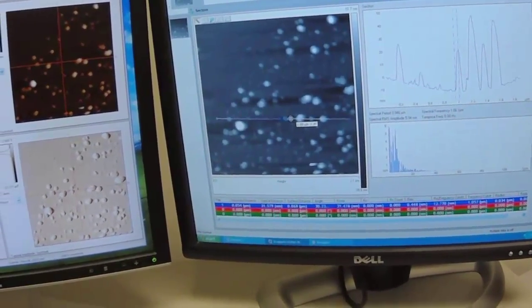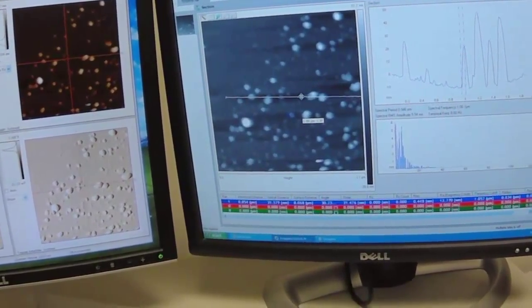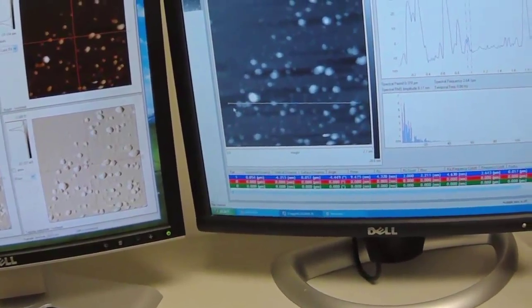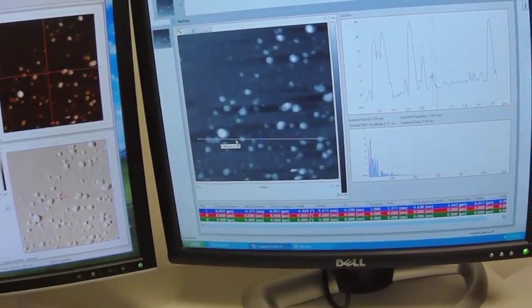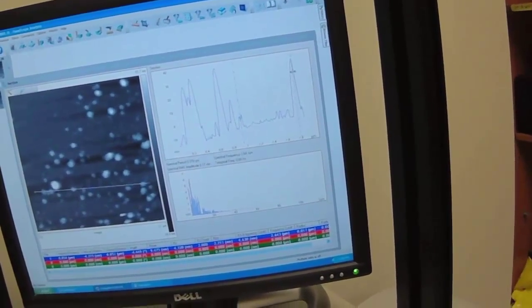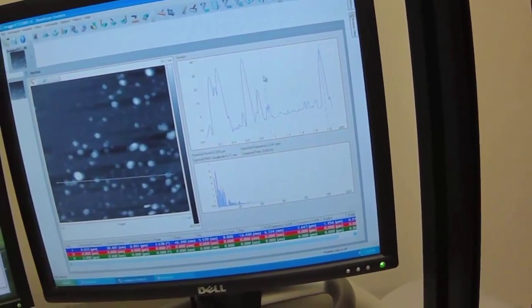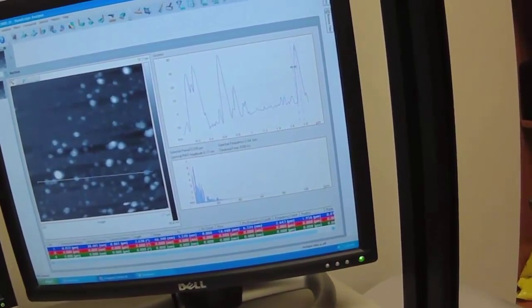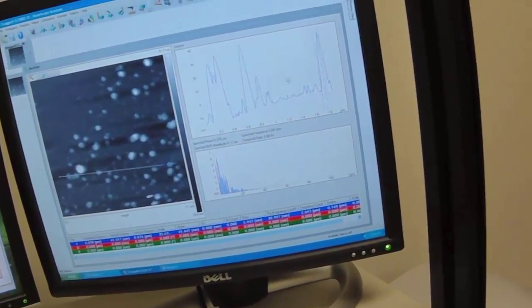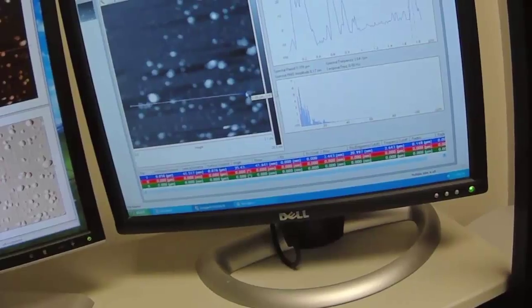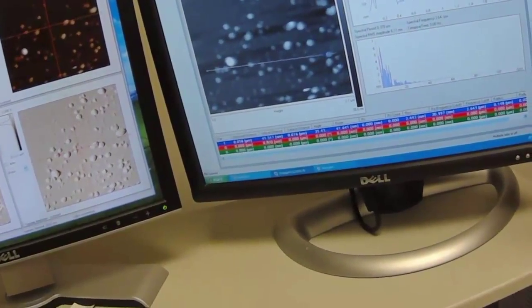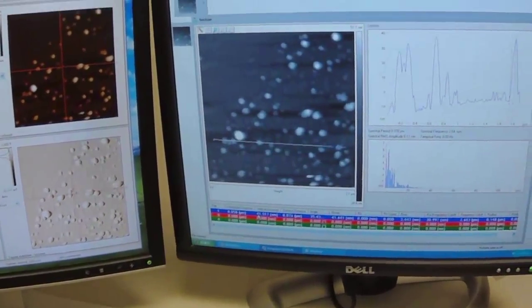Then you can pick another set of peaks, another set of bumps. You can either move this line, which goes through three here, one there, one here. It's easier to measure if the particles are separate and not stuck together. It's hard to tell where does one particle end and another particle begin. Here this particle seems to be pretty much all by itself. There's a little something there, but I can measure here. Here's another height, 41 nanometers.